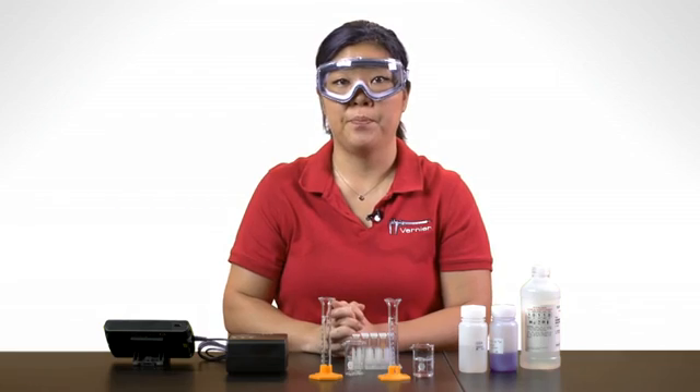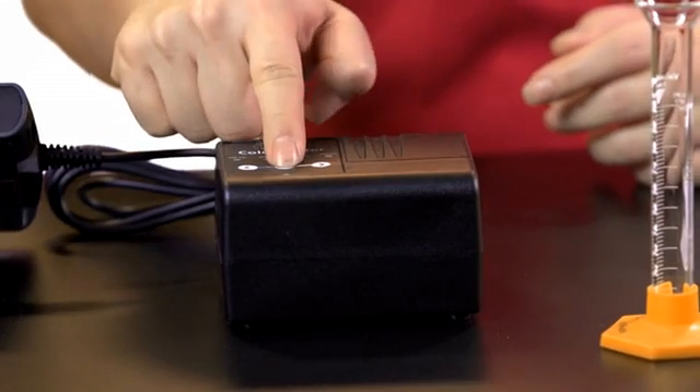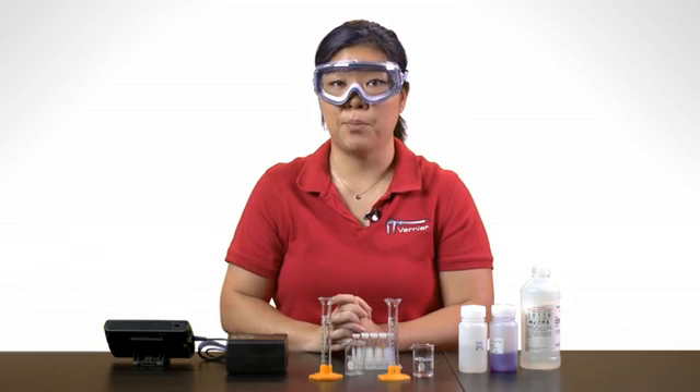Next, you will need to calibrate the colorimeter. Press the Cal button on the colorimeter. When the red LED stops flashing, the colorimeter is calibrated.